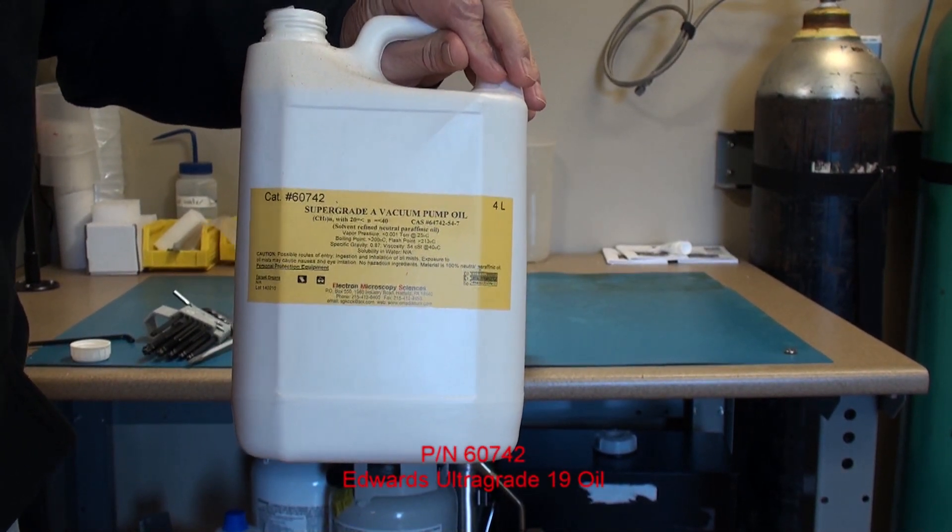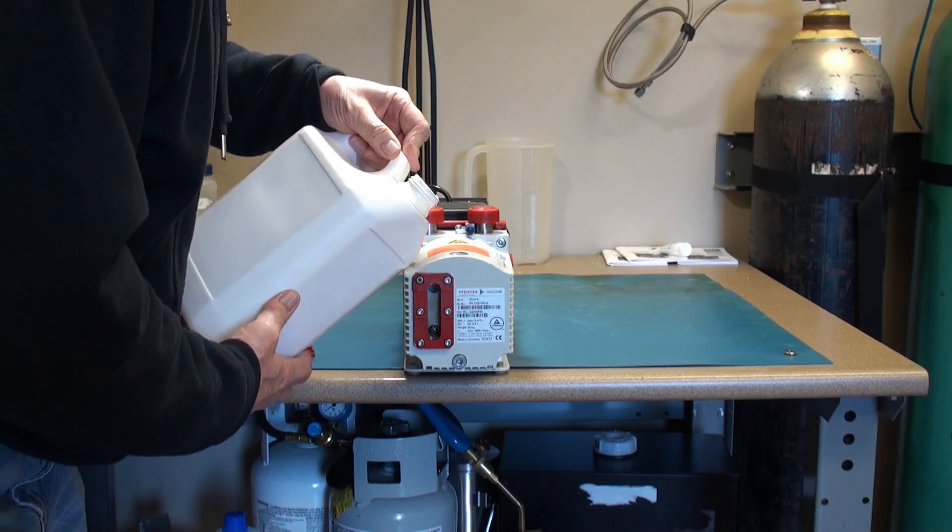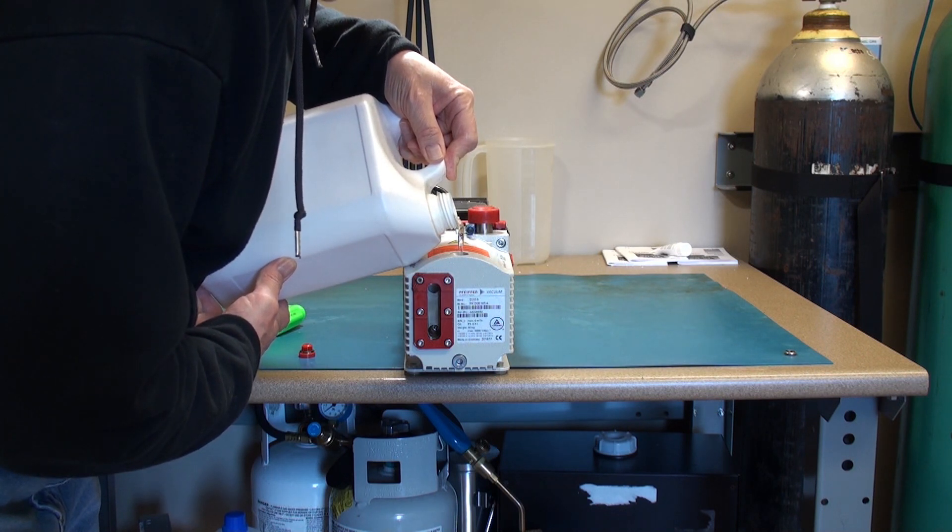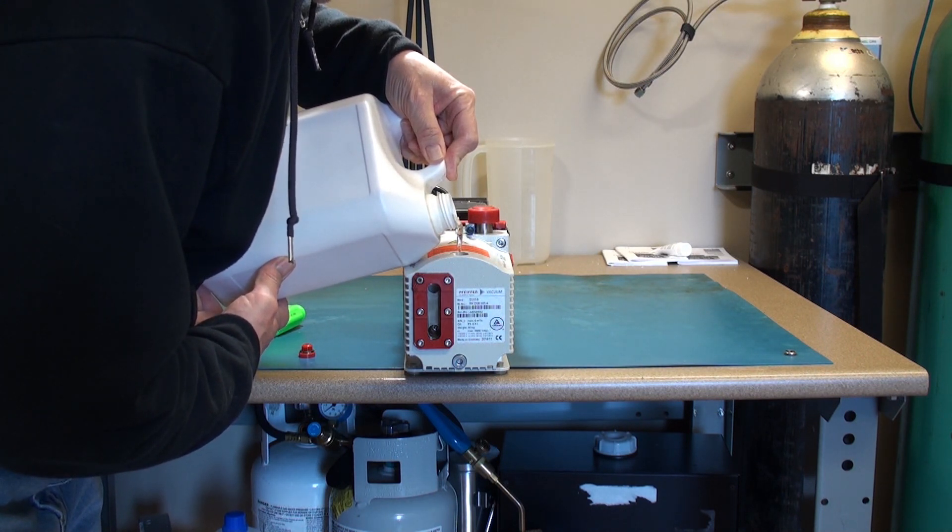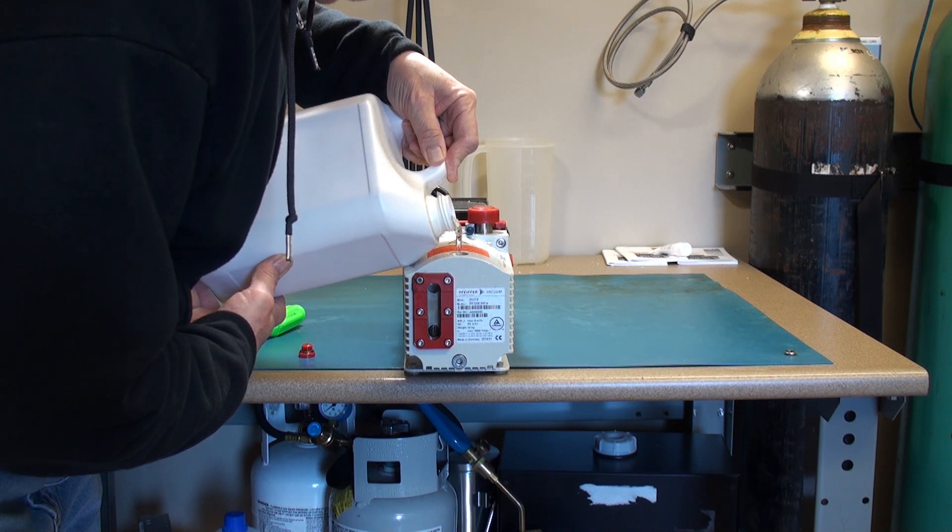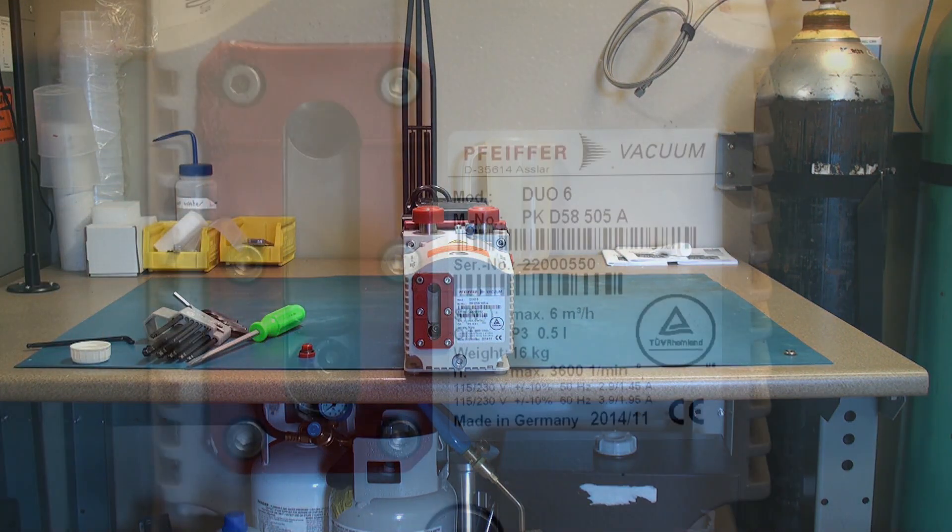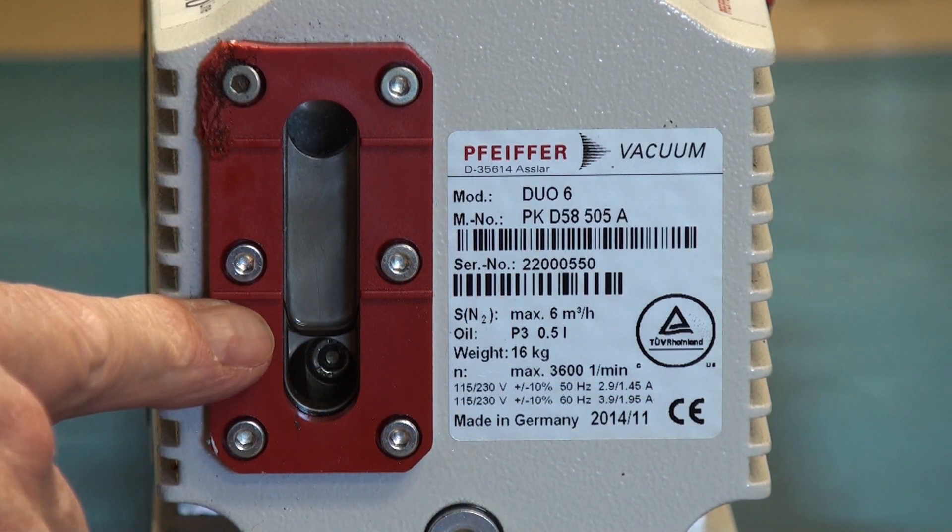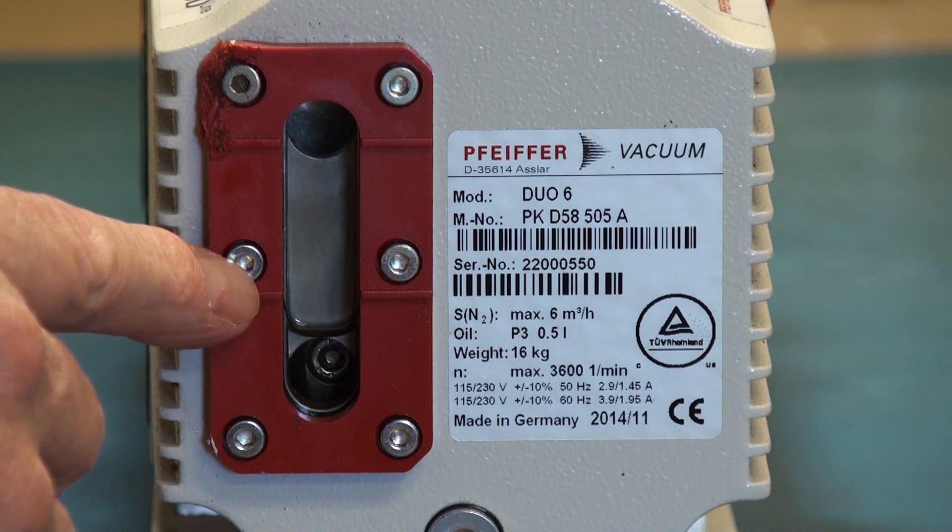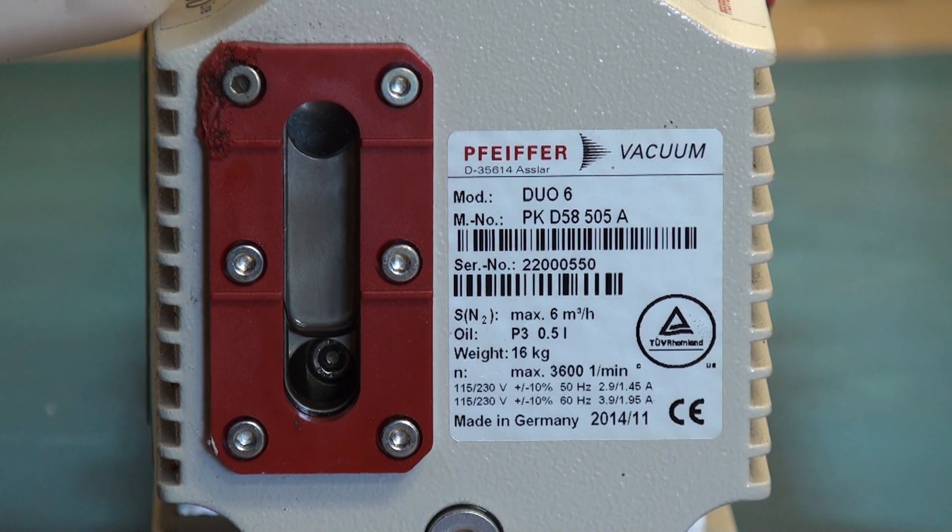Using the Super Grade 19 pump oil, which we sell, we will go ahead and carefully refill the pump. After pouring a little bit, you can see the meniscus of the oil in the sight glass come up. Generally I will raise it to about two thirds to three quarters of the way to the top of the boundary.